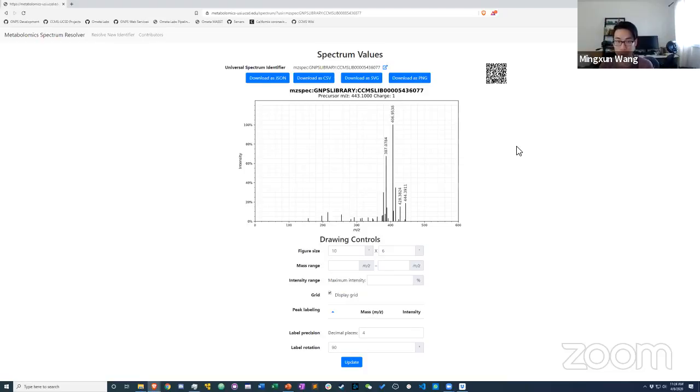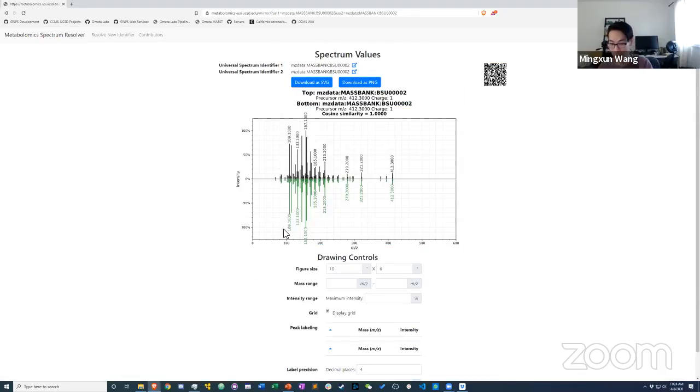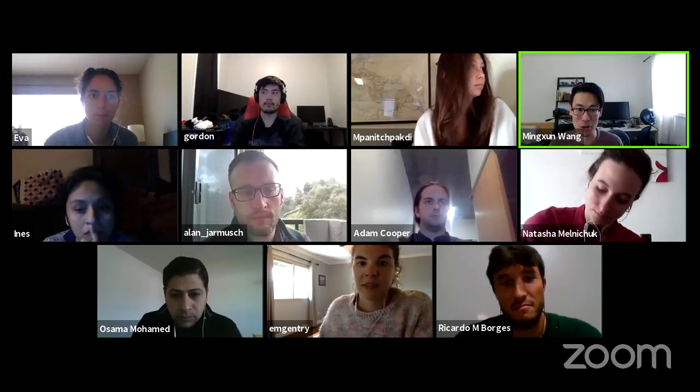As well as we do molecular networking, everything's kind of hooked up. It's a consistent way to draw stuff, and it'll be vectors so you can pull them into Illustrator. So if you have spectral matches, you can generate mirror plots like this. We think it looks better than what we had, and of course it's vector, so it has infinite resolution. So that's a small thing. Just wanted to plug that. It's kind of a big community thing.